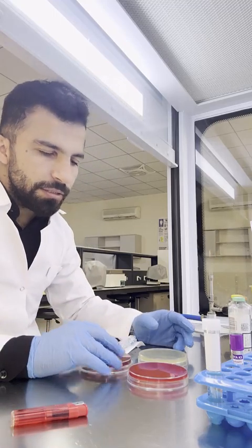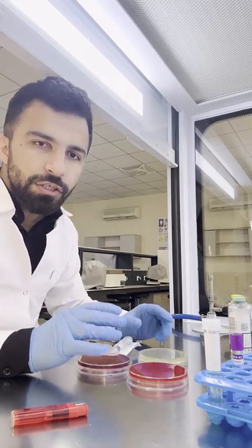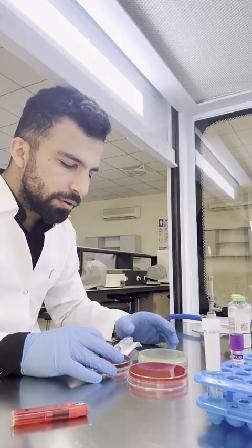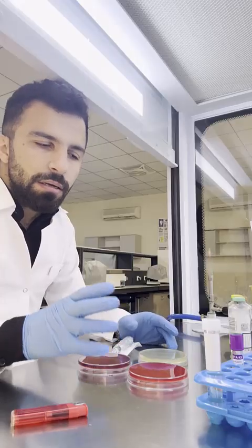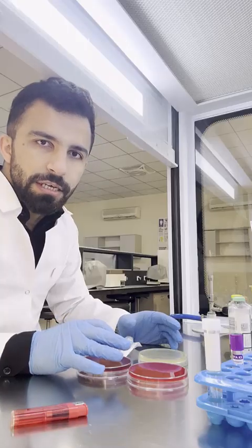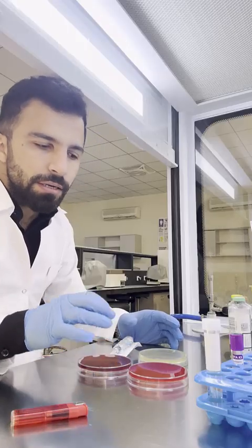Hello dear students, today's lab will be about culturing of bacteria. As we all know, bacteria can grow on solid media and liquid media. The process that we are going to do today is growing bacteria on solid media.